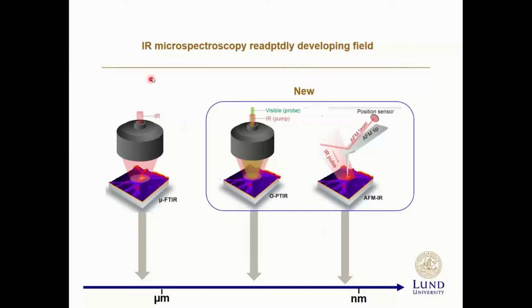It has existed for many years, and a lot of research has been done using infrared spectroscopy. However, the resolution of infrared spectroscopy is above a micron. So for the current research, it means that I could get a resolution from 5 to 10 micrometers.